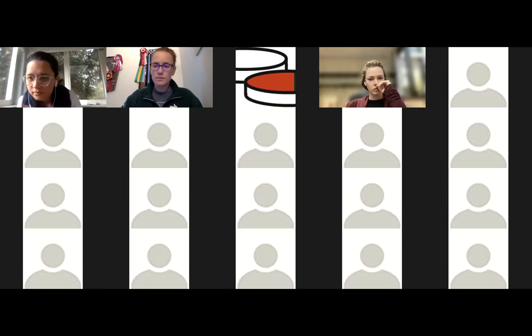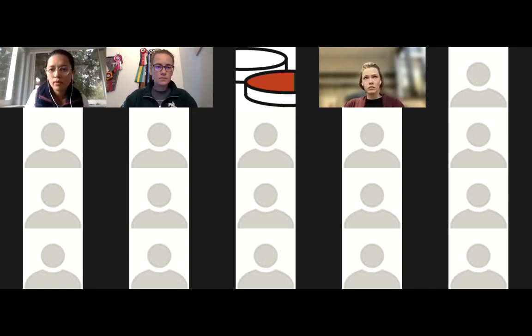Hey, Aishwarya, I just had a quick question more about looking into the CDS object to look at the gene short names and what I think are the Ensembl IDs. I feel like for humans like us, it's easier just to work with the gene short names. So why not just always work with gene short names? And is there a reason why one gene short name could have multiple Ensembl IDs? I was just wondering more about nomenclature for naming genes.